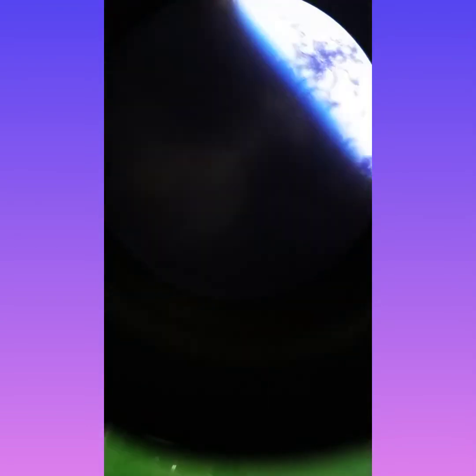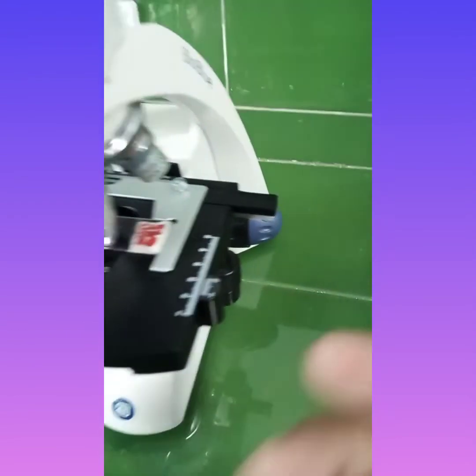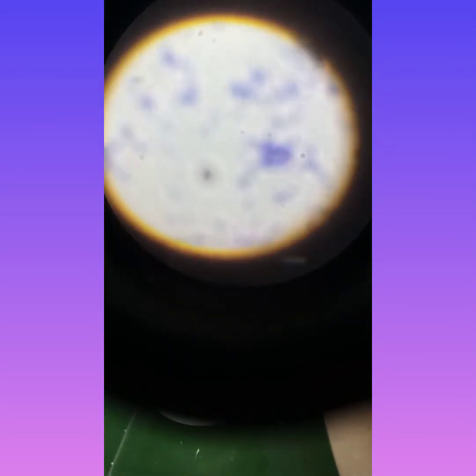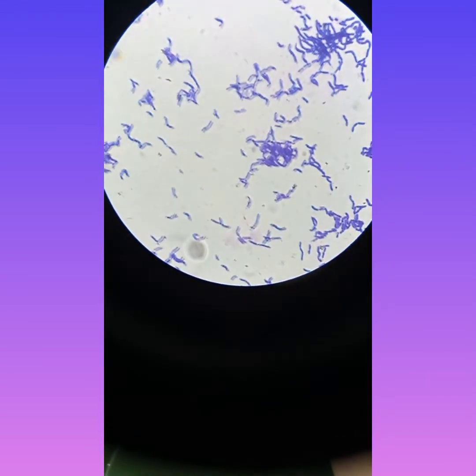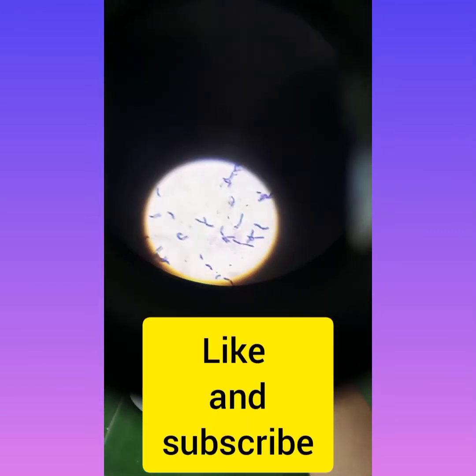Now I am moving the fine focus behind my microscope, which was blue in color, and you will observe how finely my bacterial cells will be focused. This is how the fine focus helps to improve the visibility of the bacterial cells under the microscope. You can see I moved my fine focus, and now my bacterial cells are much better visible, very clear and very finely focused. See how beautiful they looked.